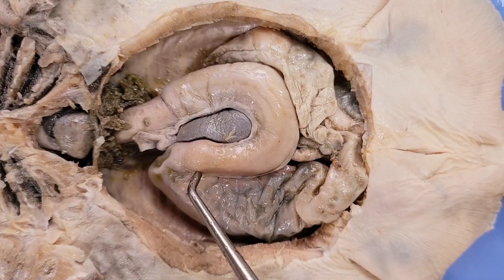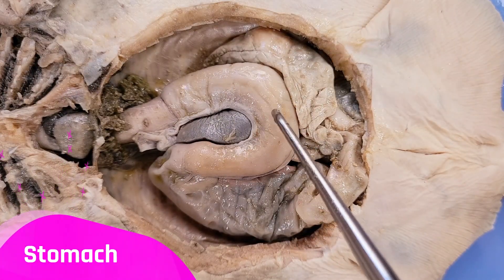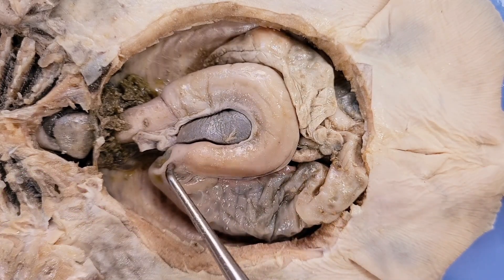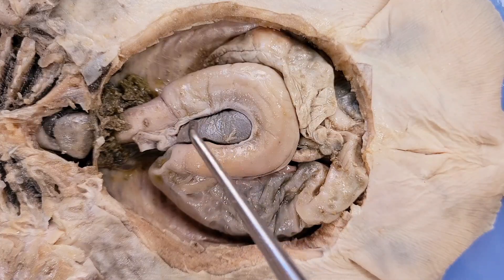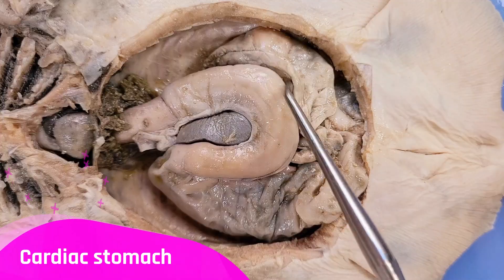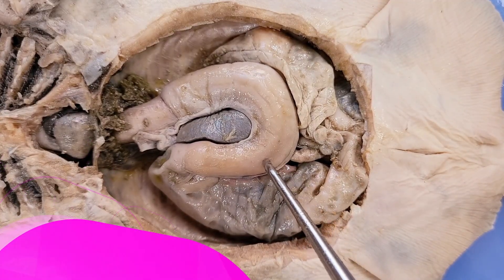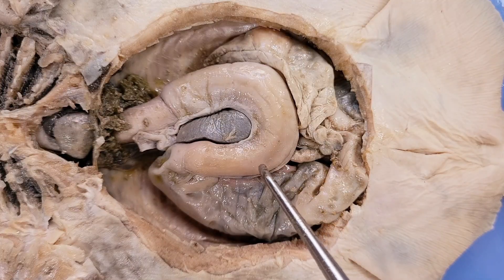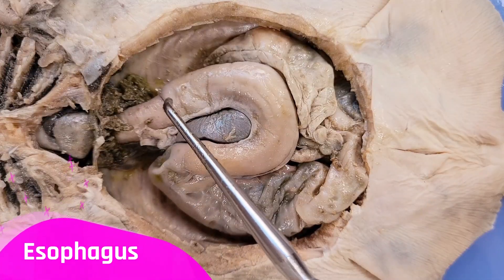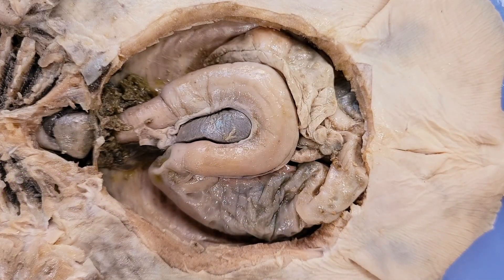Now that the liver is gone, we can see this structure here — this is the stomach of the skate. You can see that it goes down, then it bends like a hook, and then it enters the intestine. The top, more muscular part is called the cardiac stomach, and the lower, thinner part is called the pyloric stomach. The stomach uses chemical and mechanical means to break down food. You can see that the esophagus connects to the stomach, so the food the skate eats enters the stomach here.